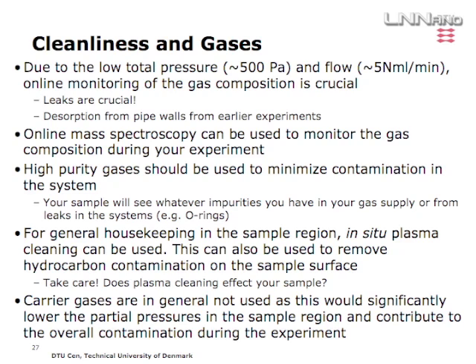On our microscope, we have an in-situ plasma cleaner for general housekeeping. So when it gets really dirty in there, we can just leave it plasma cleaning over the weekend. And we could also do plasma cleaning while we have a sample in there. But you want to be a bit careful with that because plasma cleaning does or can affect some samples quite severely.